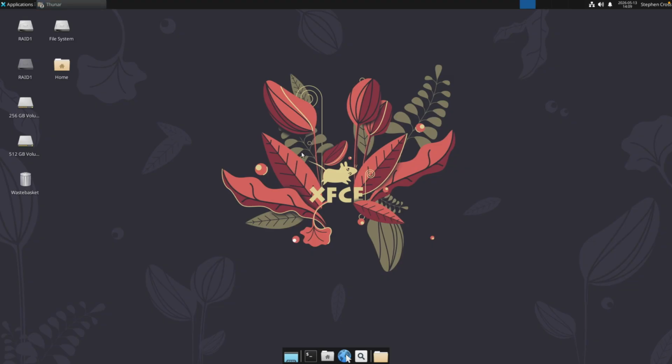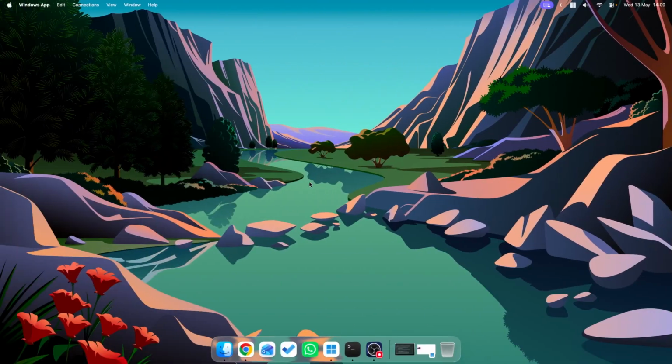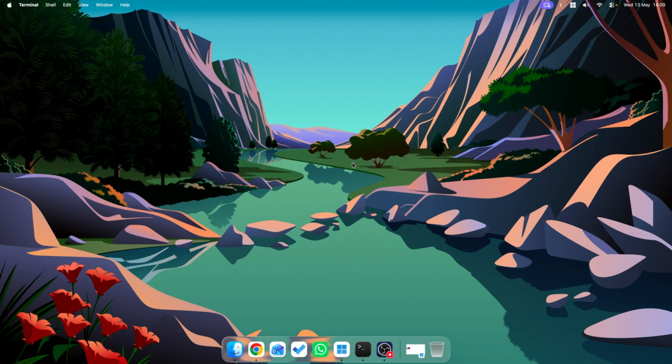I guess the only final thing to look at is logging off. So that is a bit different. You just go up to your name in the top here, and you go log out. And then at this point, we're finished, so we can just close this window and allow it to terminate. While this was being run from Mac, it's exactly the same operation within Windows, in that you're going to terminal, typing in that SSH command, and then going to your standard remote desktop and just adding in the address as localhost.